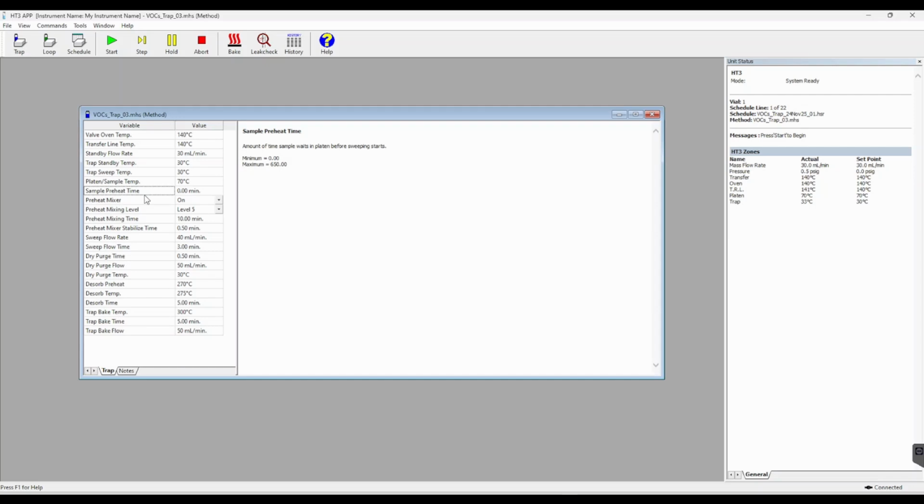Please note that these parameters are only part of the total thermal exposure time for your sample, as if you mix your sample, then it will heat whilst mixing. It is up to the analyst if they heat a sample, mix it, then let it equilibrate, or mix first and then allow it to equilibrate for longer.